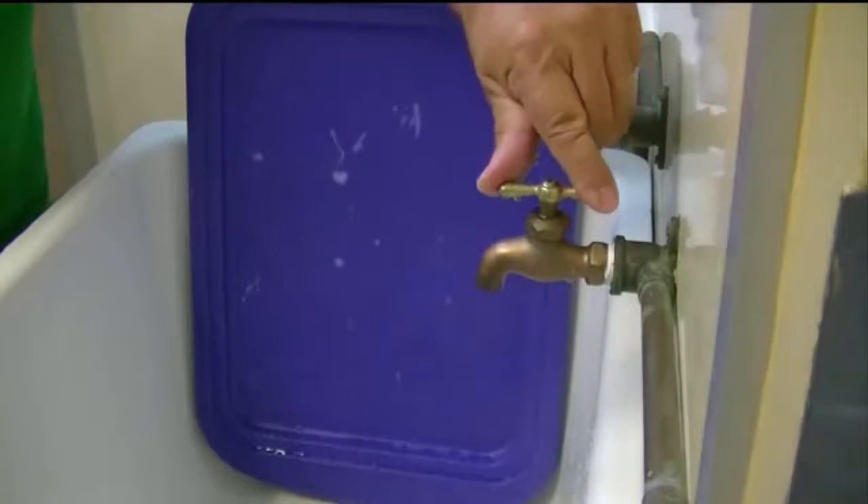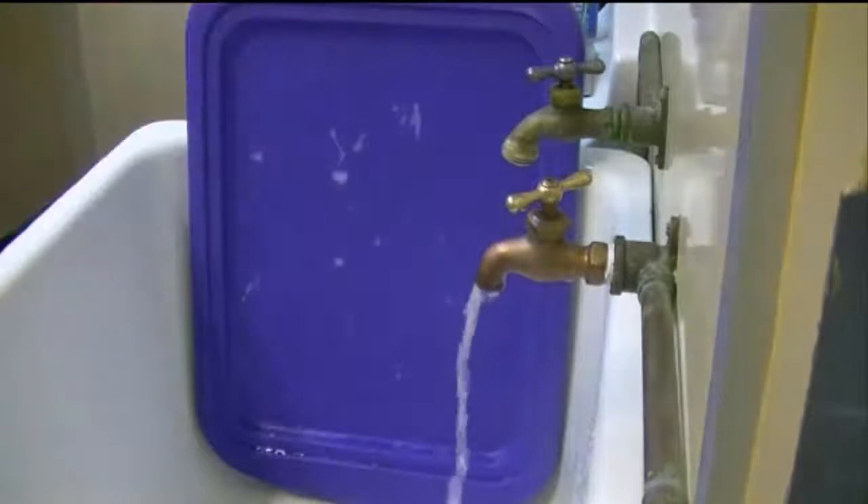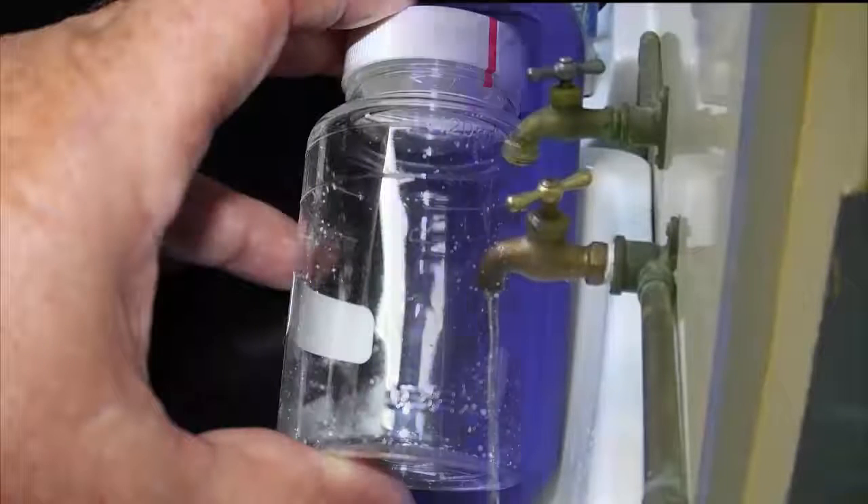Once the disinfection process is complete, gently open the valve on the tap and allow a small but steady stream to flow. Too heavy a flow will cause you to overfill the sample bottle, and too light a flow will cause the filling process to take so long that you might risk a contaminant getting into the bottle.